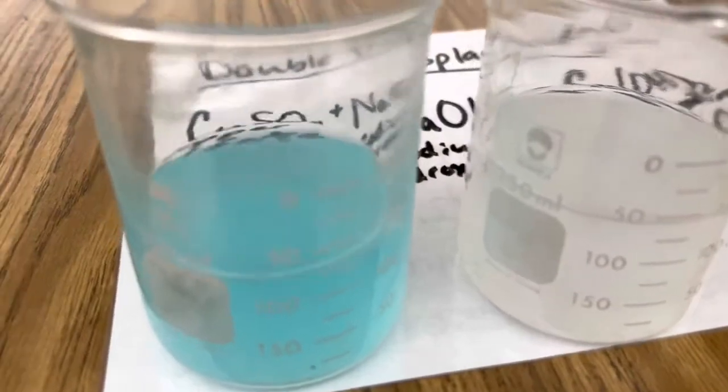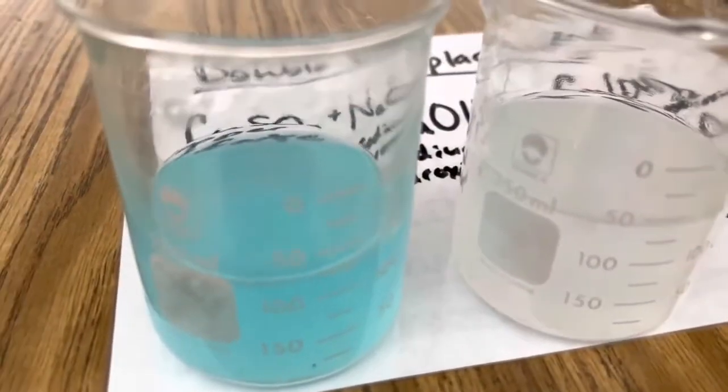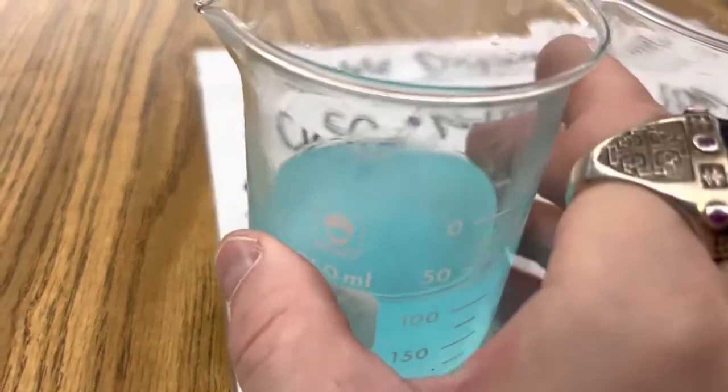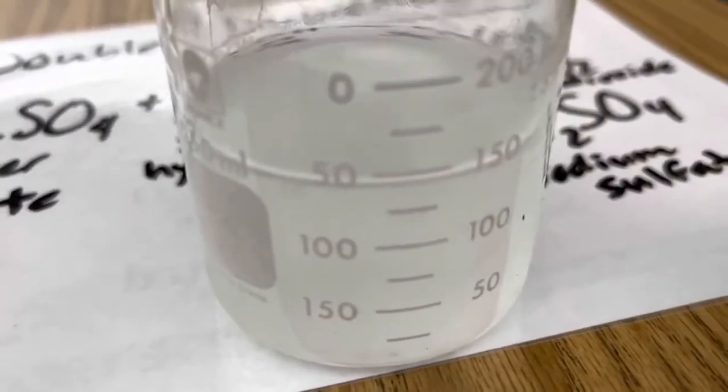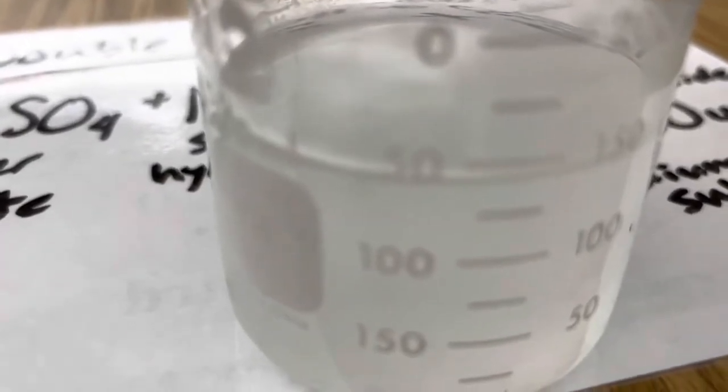Okay, once your copper sulfate is dissolved in the solution, your sodium hydroxide is completely dissolved, you're ready to slowly add your copper sulfate into your sodium hydroxide, and you'll see this blue gelatinous precipitant, which is the copper hydroxide that immediately forms when you add the two.